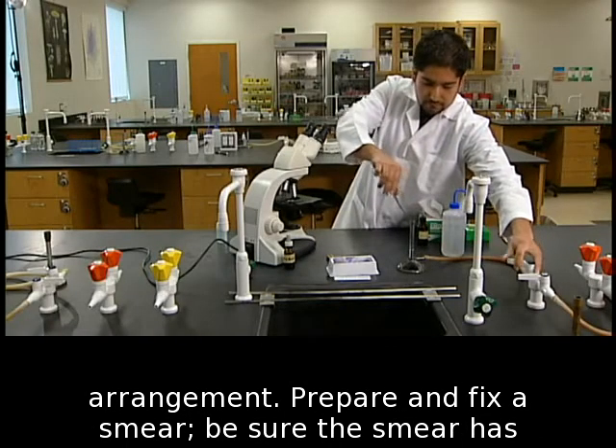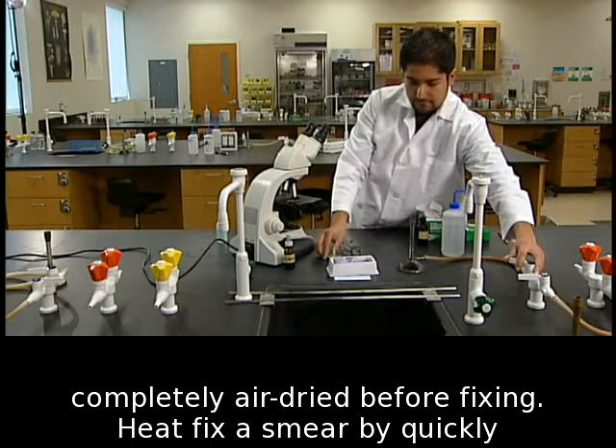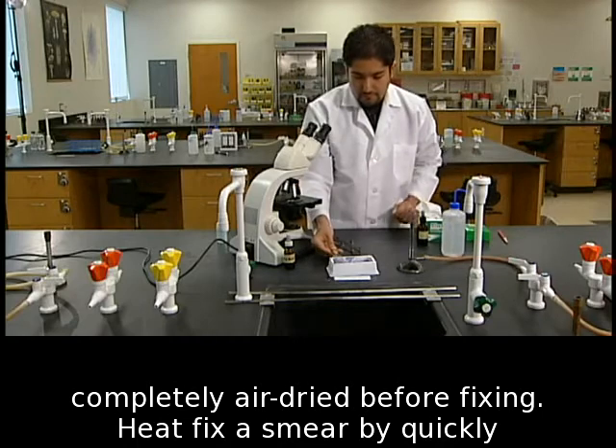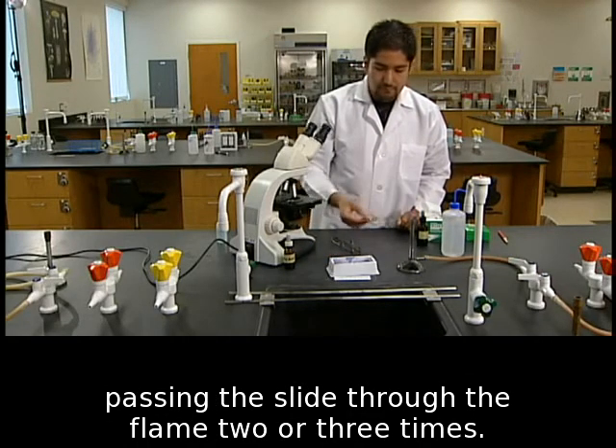Prepare and fix a smear. Be sure the smear has completely air-dried before fixing. Heat fix the smear by quickly passing the slide through the flame two or three times.